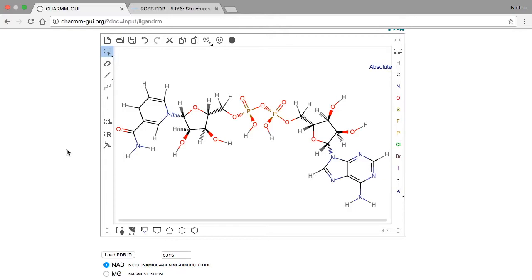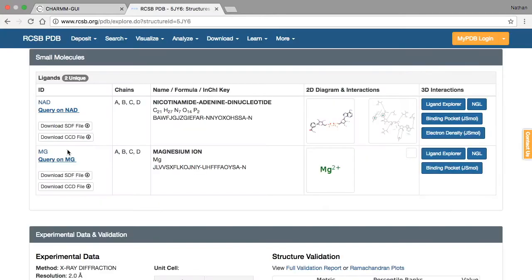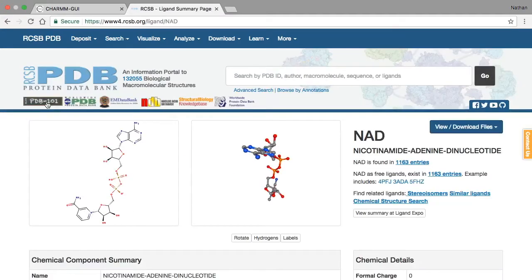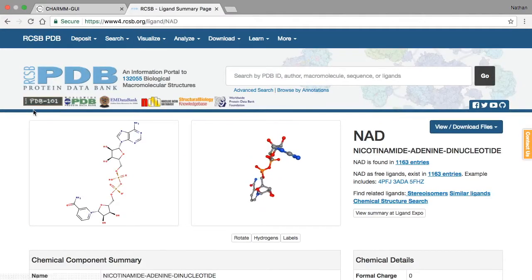This is important because the PDB file for 5JY6 does not show hydrogen atoms, but hydrogen atoms are shown in this structure. Going back to RCSB, we can click on the link for NAD to see the structure that LigandReader is using.